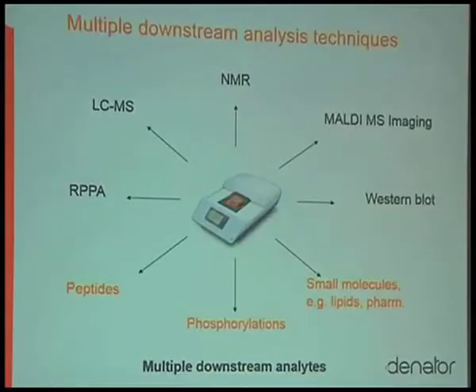So now let's get more into the technology and the comparison between using heat stabilization and using standard workflows. It's an upstream technology, and that means that it comes very early, close to the sample source. Afterwards, you can do most ordinary proteomic techniques, from Western blot and 2D gels through LC-MS-based technologies, phosphoshotgun, and so on.